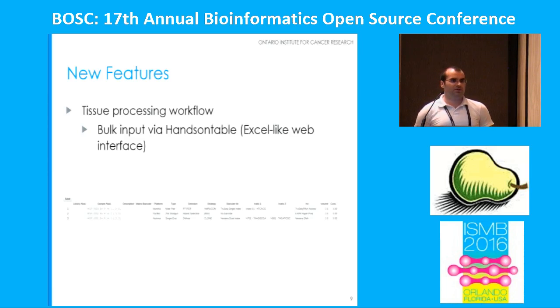the tissue processing. We do the preparation, slide preparation, laser captured microdissection. We handle a lot of formalin fixed, paraffin embedded biopsy samples, which require separate processing.